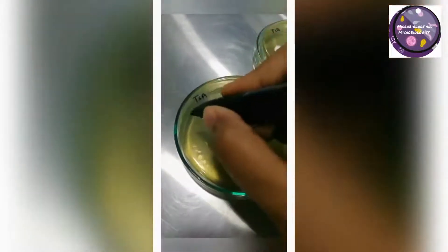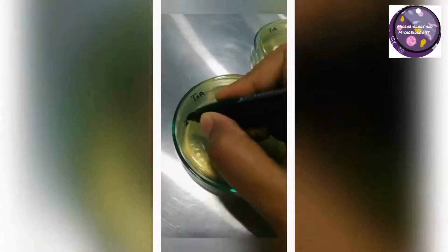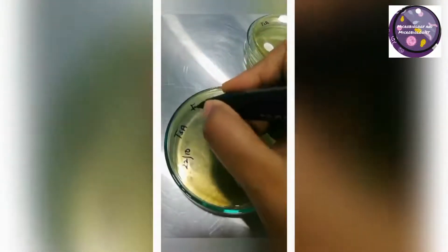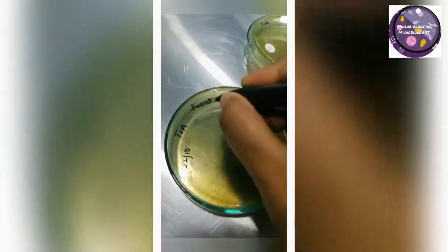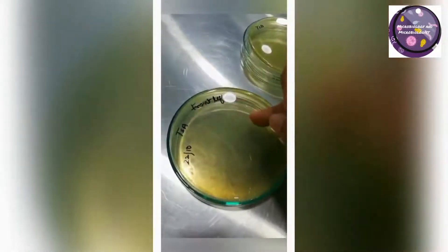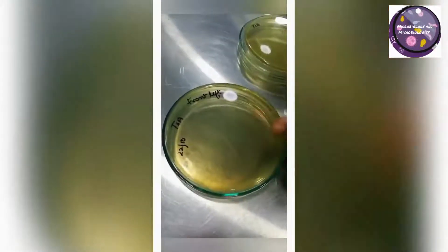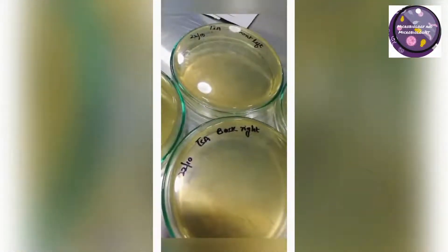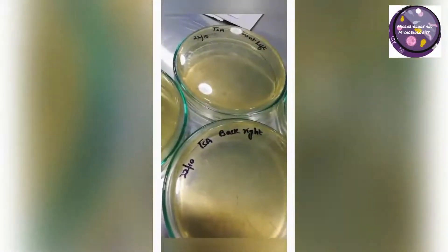Prepare your pre-incubated media plates with the media name, date, and location name or the point where the media plate will be placed. The point name must be mentioned so that if you get any abnormal or false results, you can examine the specific location. Mark your place like this.